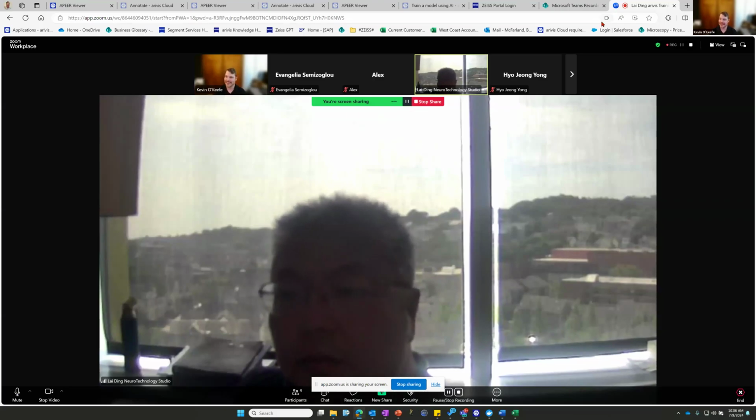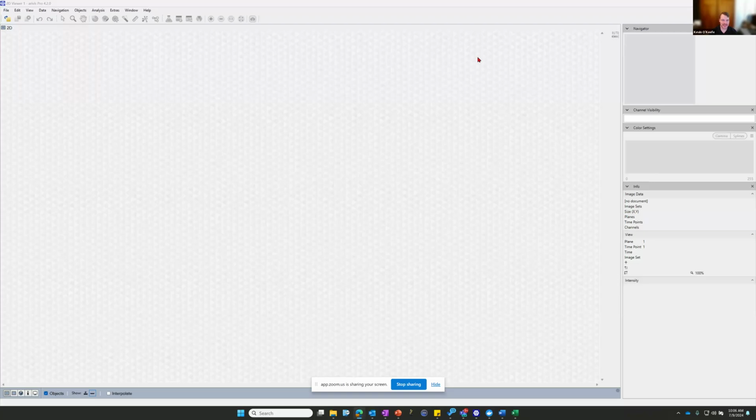All right. So I'll go ahead and minimize this. And we'll go ahead and get started with first, I'll overview Arivis Pro. And then towards the second half, we'll go into Arivis Cloud.